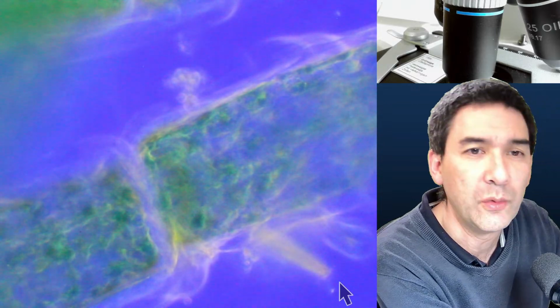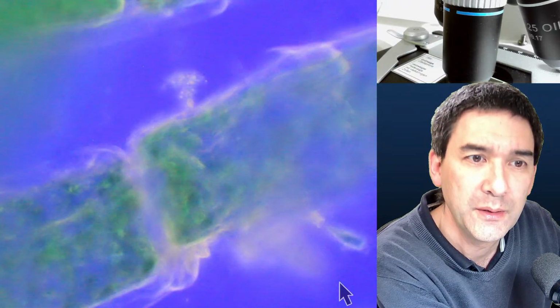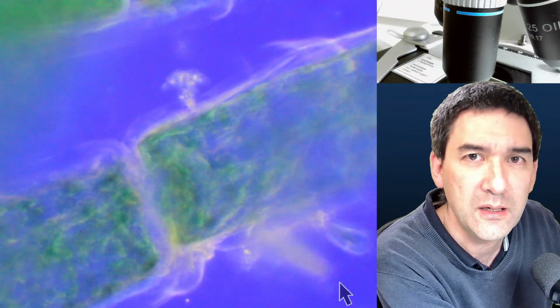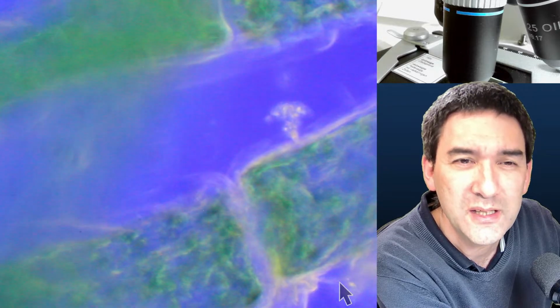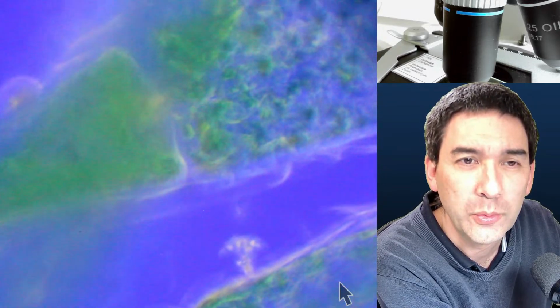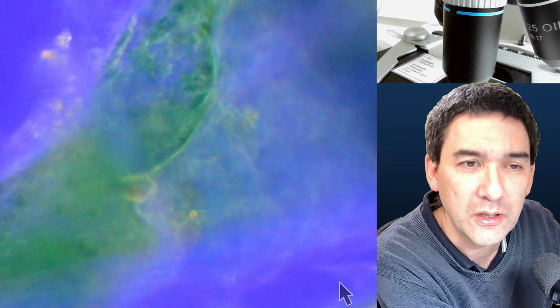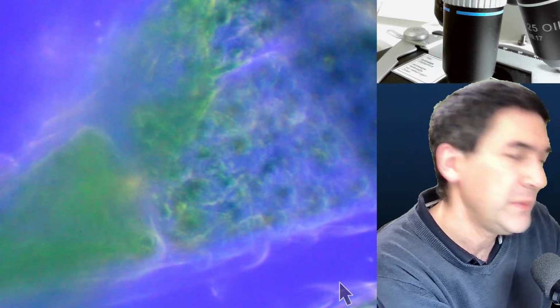Normally, for water life, you use glycerol jelly or glycerin gelatin, because it is a water-based mounting medium. If you use any mounting medium that contains some kind of an organic solvent, then this solvent would dissolve the chlorophyll pigment, the green pigment, and you would definitely lose the color.